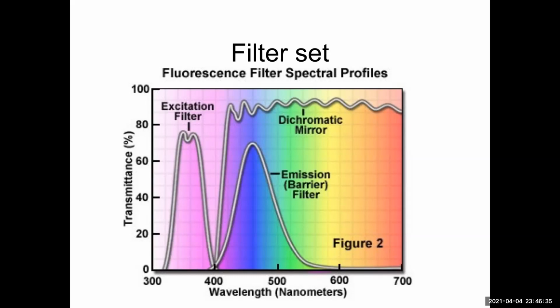So nothing's ever perfect, but notice that you're throwing away light, because you're sometimes not catching the peak of what the fluorophore would prefer. And then you're throwing away light because you're only getting 80% of what the lamp produces and so on. So at every step involved, there's some trade-off happening, some loss really happening.